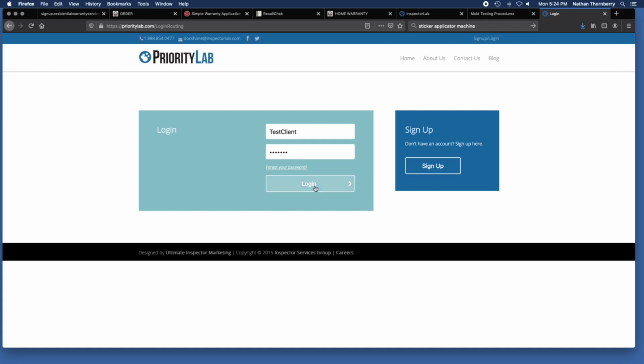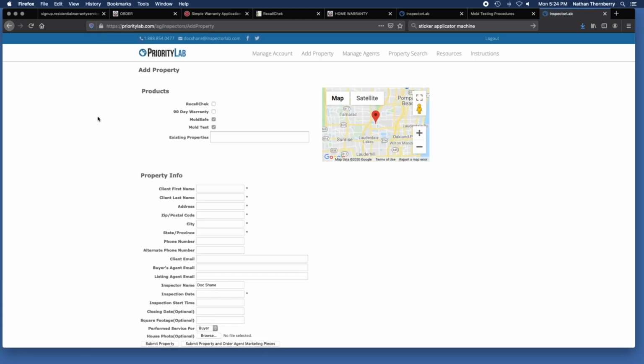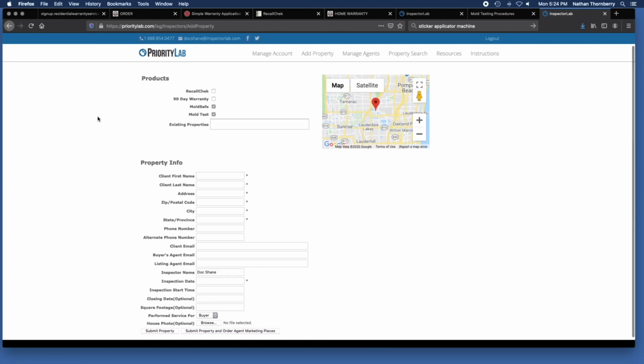All right, when you log in, the first thing that you're going to see is a property data page. And what this does is it allows you to submit a mold test, a chain of custody essentially. And lots of people go here and then fill out this form, and it'll show up in their InspectorLab app so that they can do the rest digitally on site and quick. But if you've already submitted a chain of custody to us, it doesn't matter whether it was through our app, through this online feature, through CRMs like NextInspect and ISN, or even through the inspection reporting platforms, which we're integrated with just about all of them.